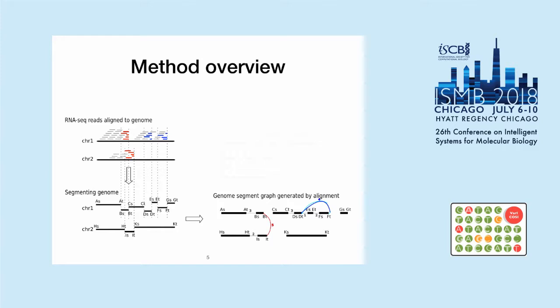With the assumption that sequencing error and alignment error are random, and that these error-induced discordant reads are relatively rare compared to concordant reads, we filter out the sequencing error and alignment error-induced discordant edges by rearranging the genome segments and linearizing them to maximize the total number of concordant reads with respect to the newly rearranged, newly linearized sequence.